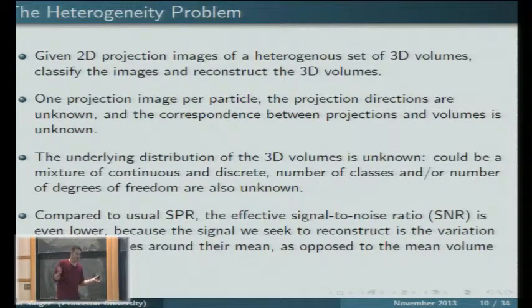So if we did everything and reconstructed an average volume, now to understand the variability, we can reproject that volume and remove the mean, remove just the contribution of this average volume. If you remember the noisy images that I showed before, suppose I remove the contribution of the average, you're left with something that looks very similar to pure noise, because even though there was this tiny signal there, now I've removed it.